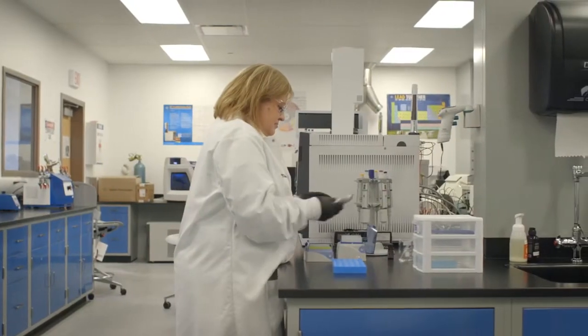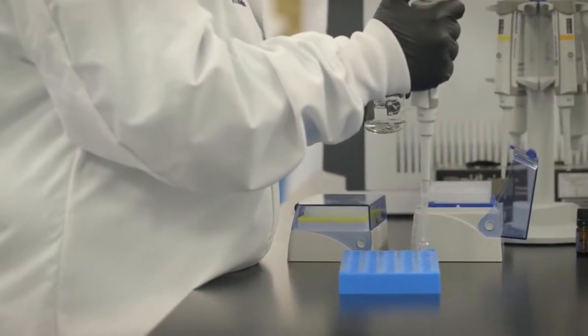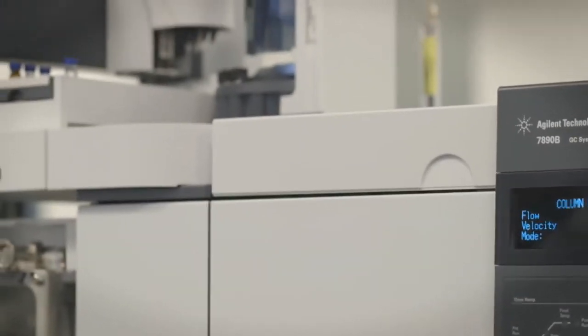GCMS, or gas chromatography mass spectroscopy, is the workhorse machine we have in the lab. It helps identify each essential oil. It aids in determination of the purity and the strength, as well as the composition of each essential oil. It'll also help identify potential contaminants that shouldn't be in an oil.